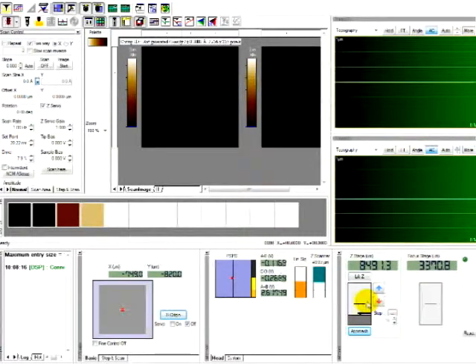It is a little bit hard for beginners to control set points, so we have another technique called double approaching, which is after you first approach, you can click on the Z stage up just a little bit until the Z scanner goes down. So in a topography signal, you won't see any signals.